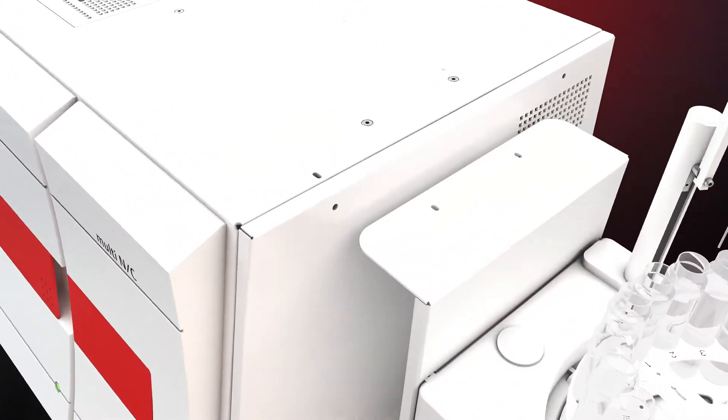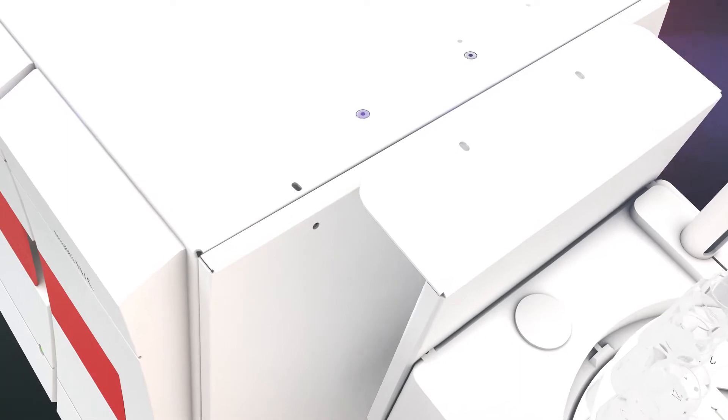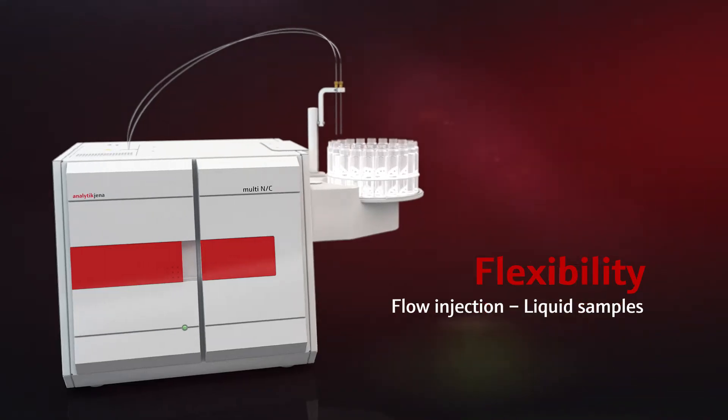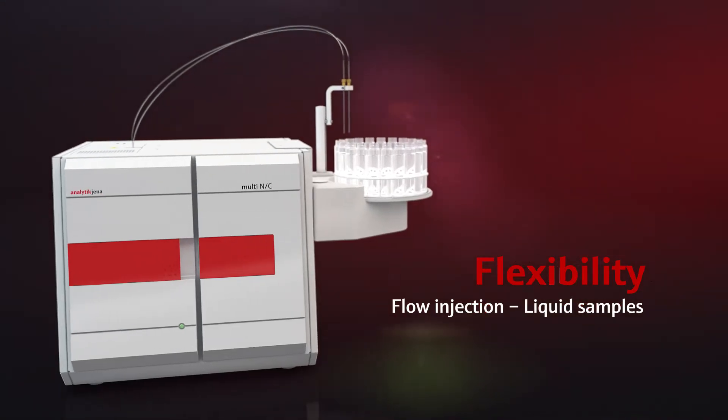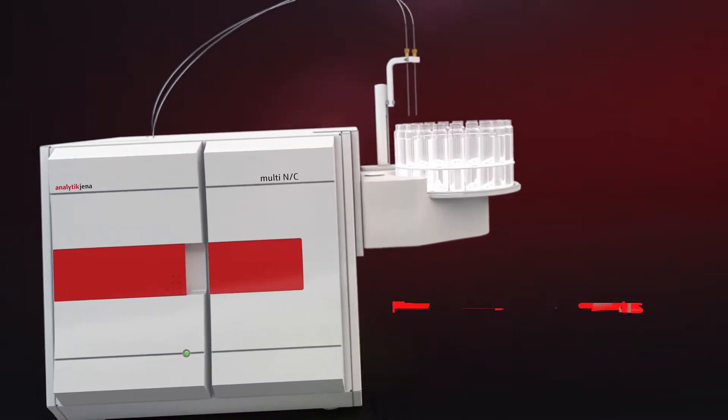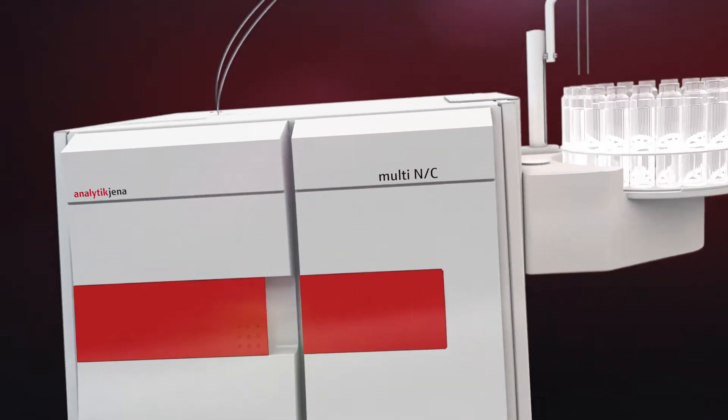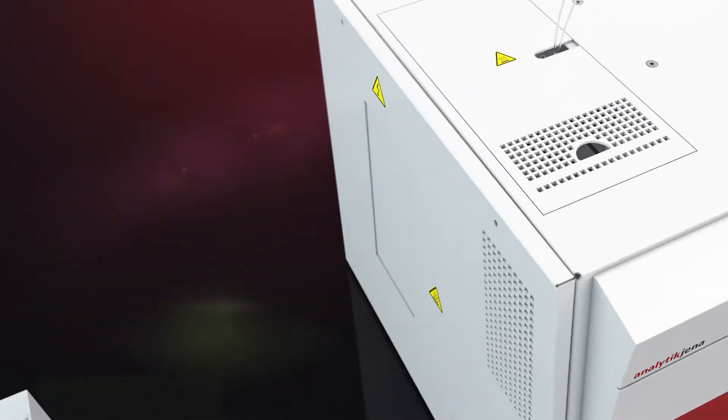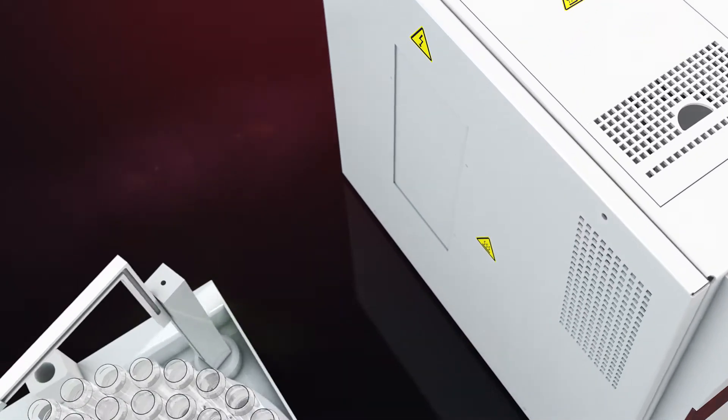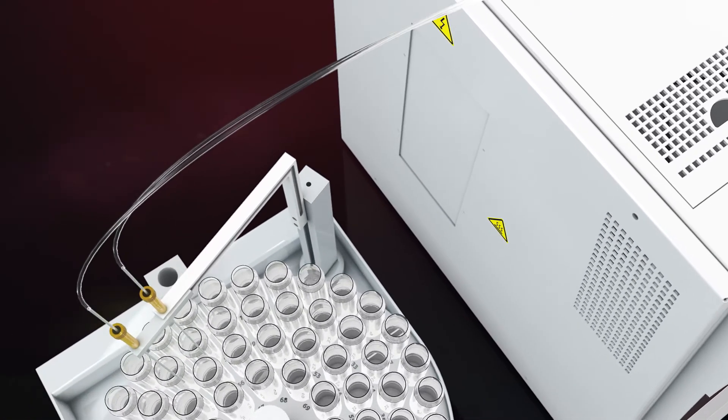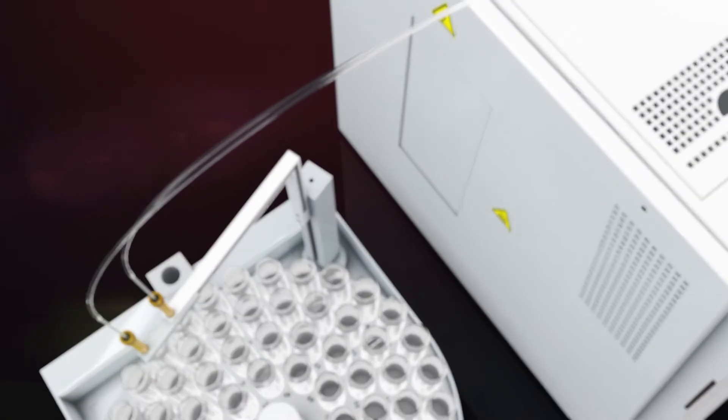Multi-NC is a versatile analyzer. It readily deals with high-temperature combustion or UV-promoted digestion, flow or direct sample injection, low or high sample numbers, water or solid samples.